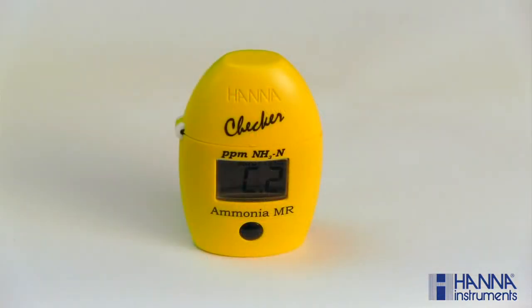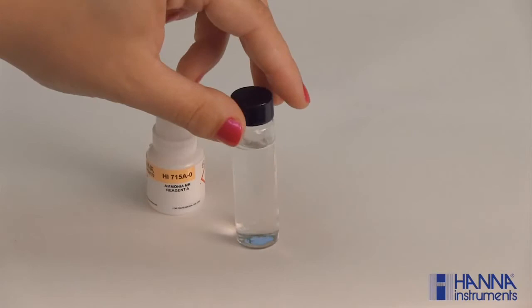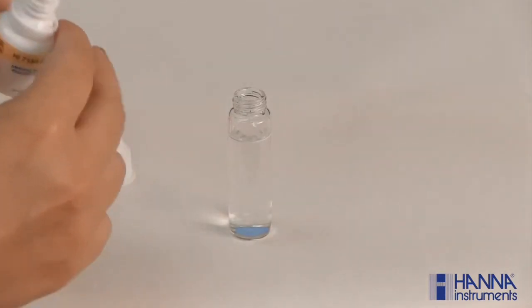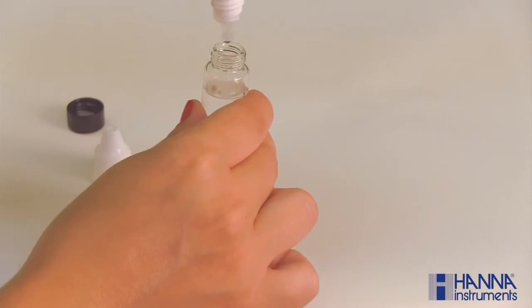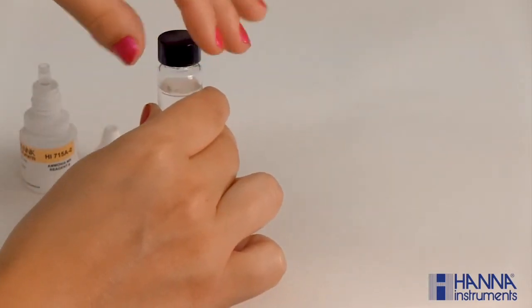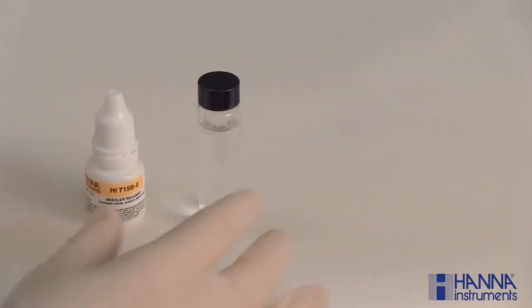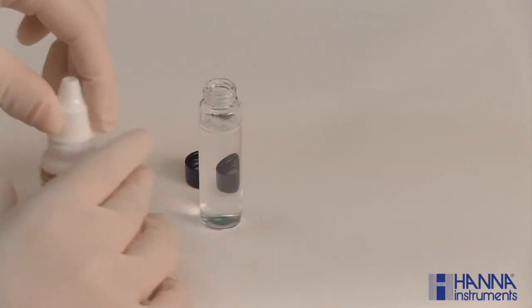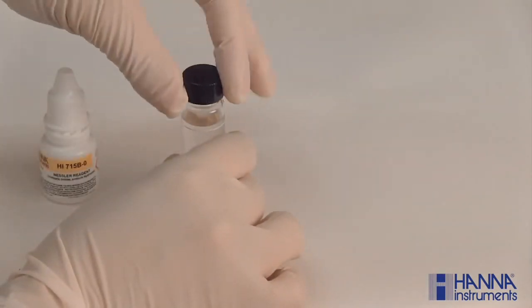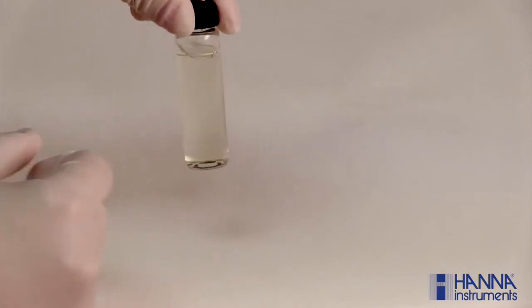Remove the cuvette and add 4 drops of our HI-715A-0 reagent. Replace the cap and swirl. Remove the cap again and add 4 drops of our HI-715B-0 reagent. Replace the cap and swirl. Lightly tap the cuvette to remove any bubbles that may interfere with the reading.